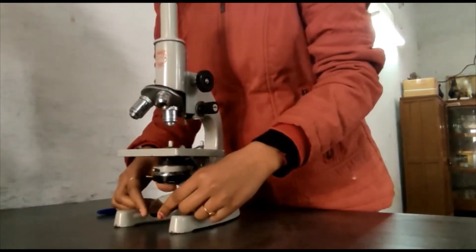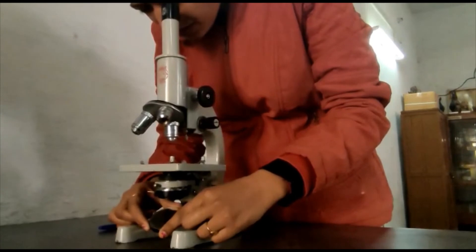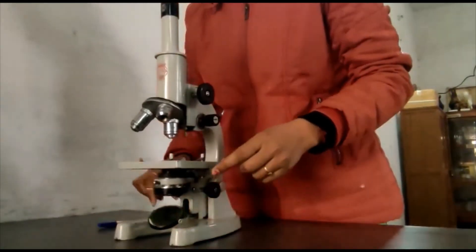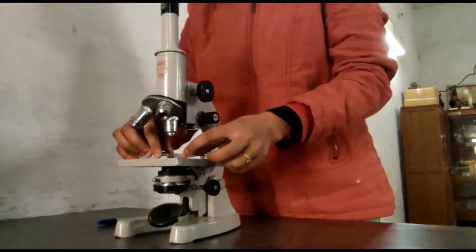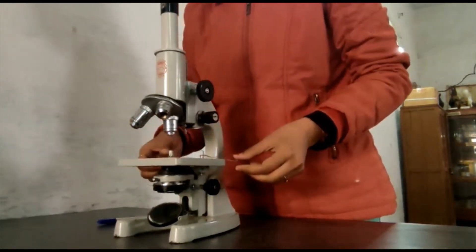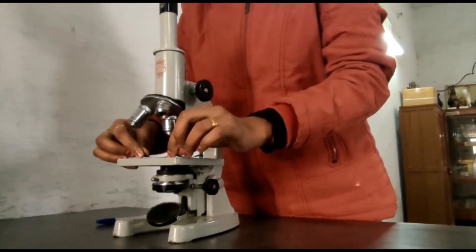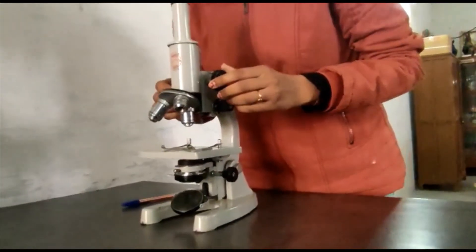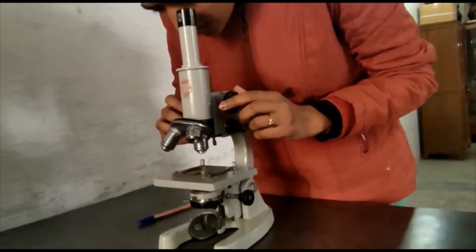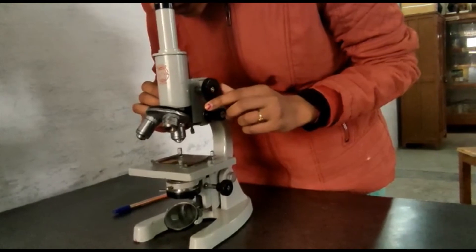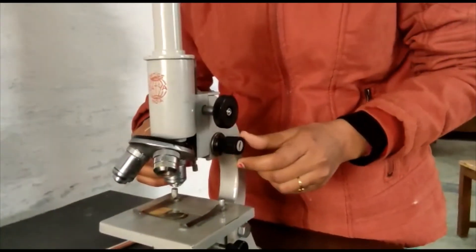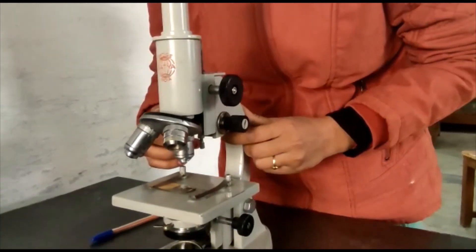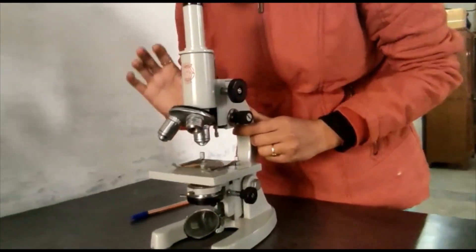Now I will show you the working of microscope. Firstly we will set the light with the help of mirror. Then we place the specimen on the stage and focus the slide with the coarse adjustment, and then with the fine adjustment we produce a sharp image of the specimen.